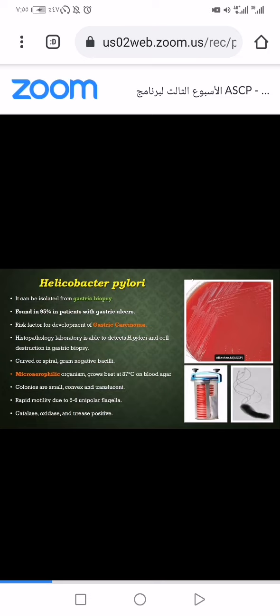It will make the anaerobic environment inside the jar, and we put the jar in the incubator. Why do we put it in the incubator? Because we need the temperature. Okay. This device can give us a microaerophilic or anaerobic environment, depending on the type of the bag. Okay, there is a special bag for the microaerophilic and a special bag for the anaerobic environment.